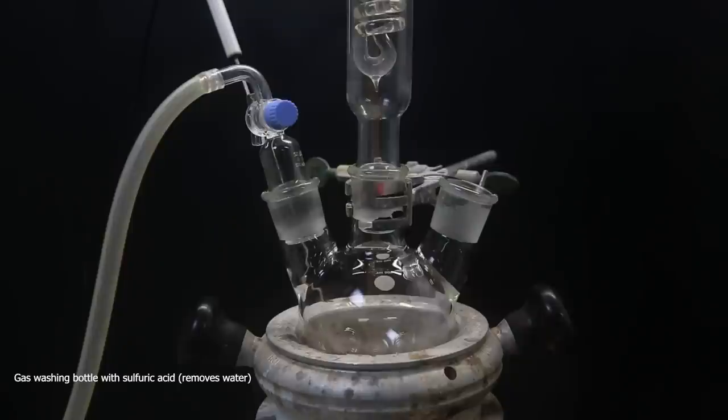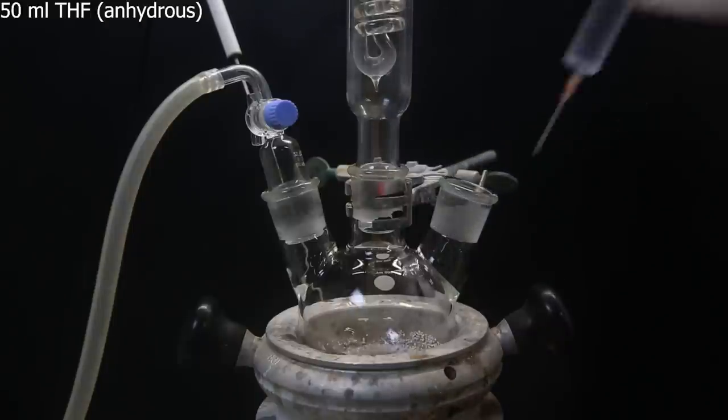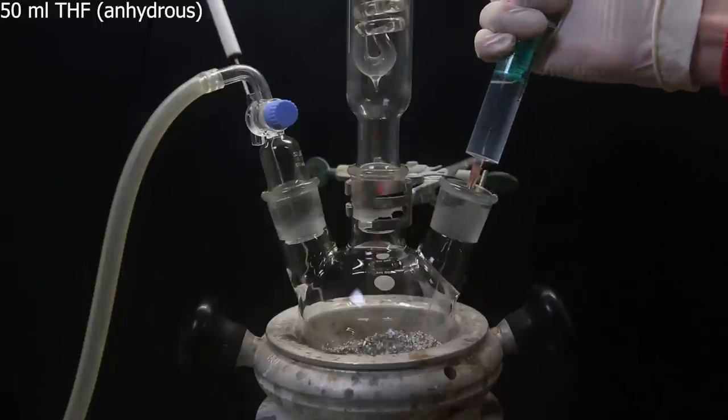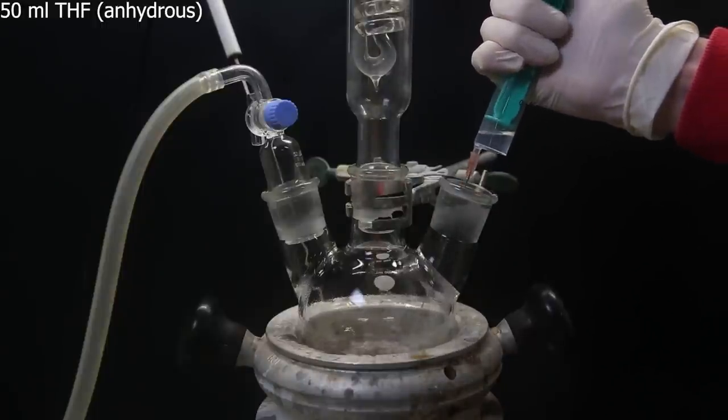Bubbling the nitrogen through the sulfuric acid will make sure that the stream is dry, and I let it blow constantly through the setup. I attach a funnel and then add in 5.5 grams of magnesium turnings. Then with a syringe, I add in 50ml of anhydrous THF, because the reaction will only work if the solvent is dry.